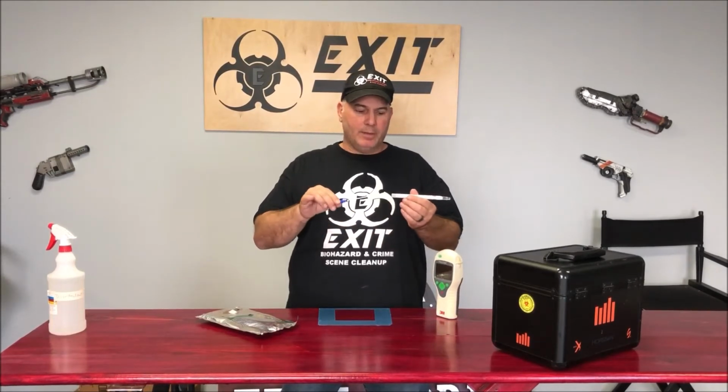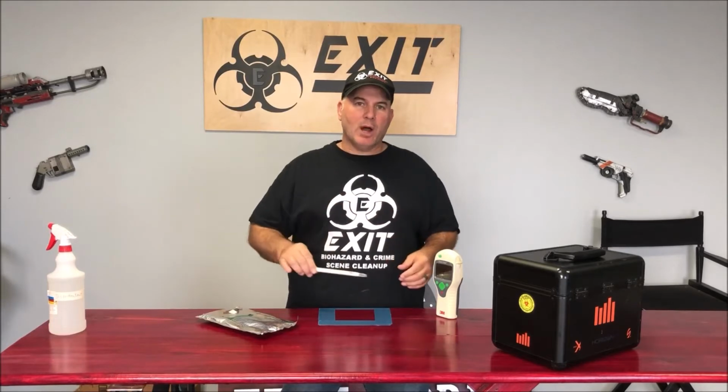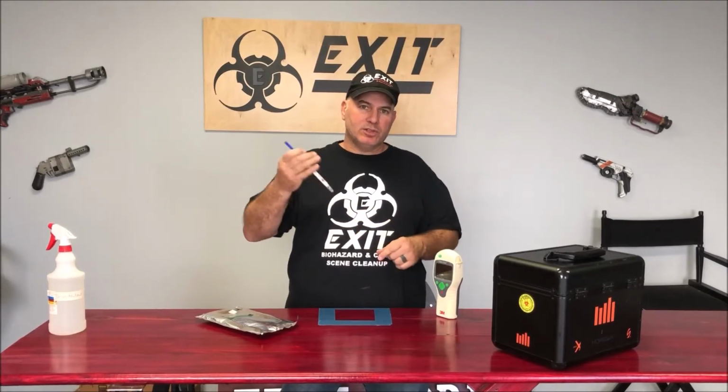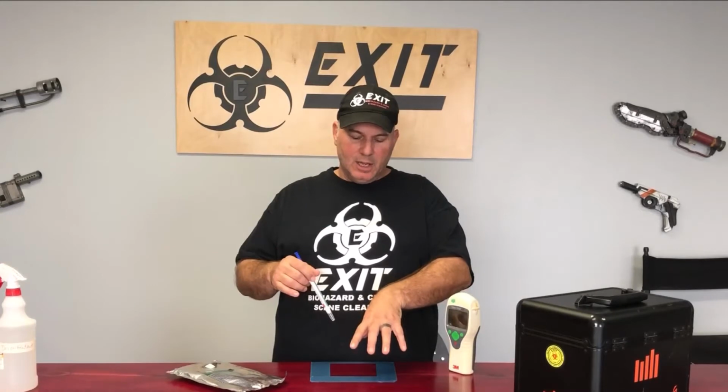This has a swab in it. We're going to swab an area. We're going to crack this so the liquid reaches the swab, shake it up, put it in the machine. The machine's going to generate a number. It's going to give us a way of understanding what the RLU number is for that specific area.